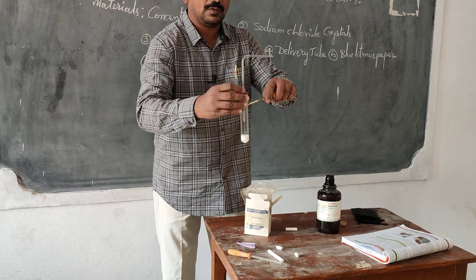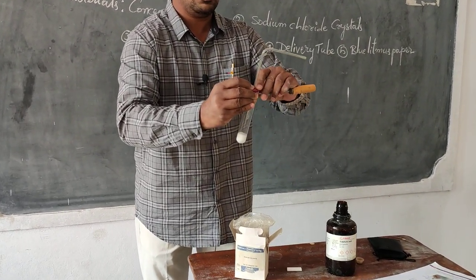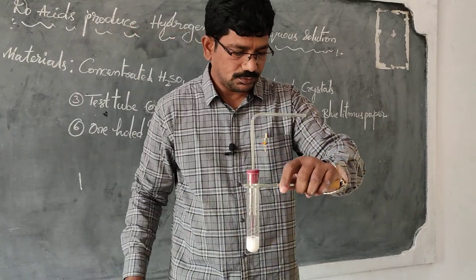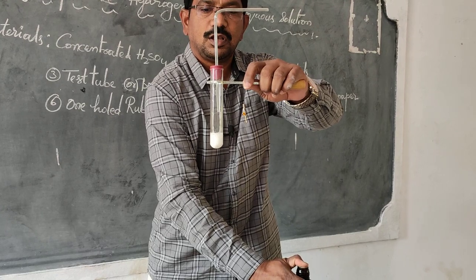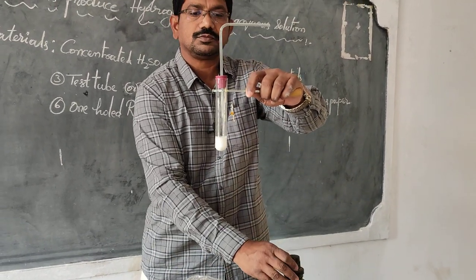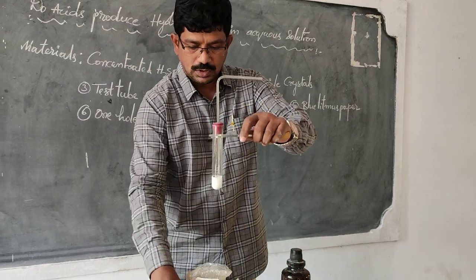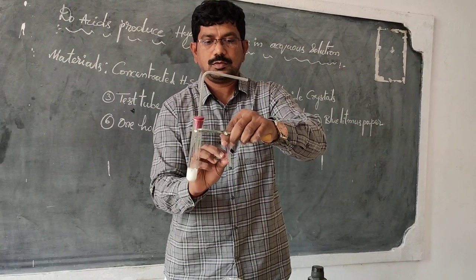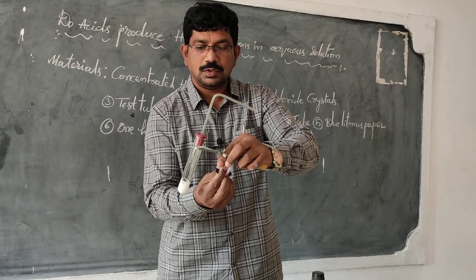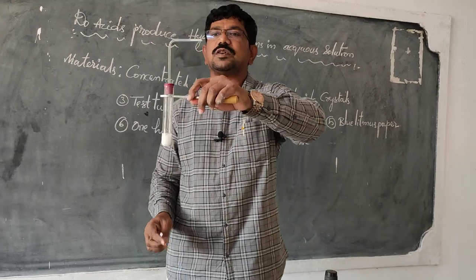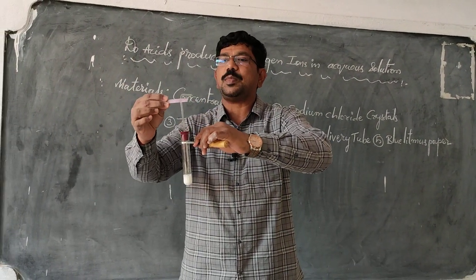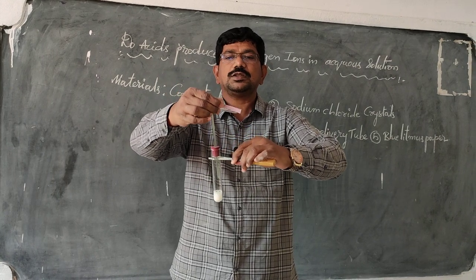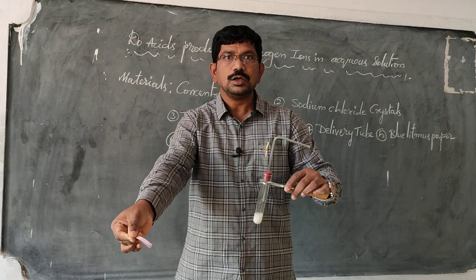Observe: what is the change taking place? Some reaction is taking place. You can observe from the delivery tube that some gas is being evolved. I am testing the gas with the help of the blue litmus paper. Is there any change in its color? There is no change.